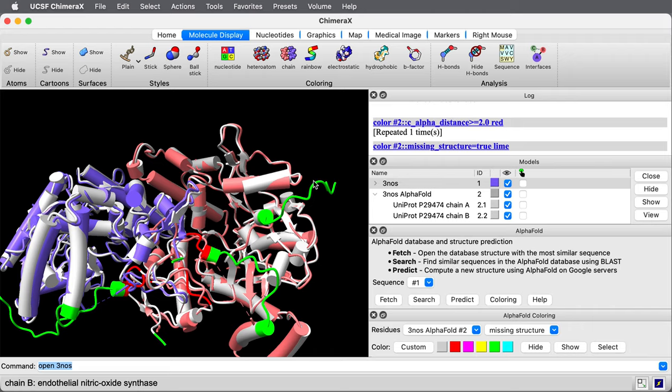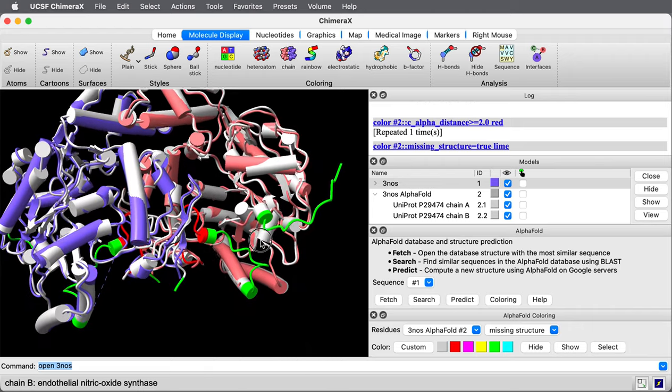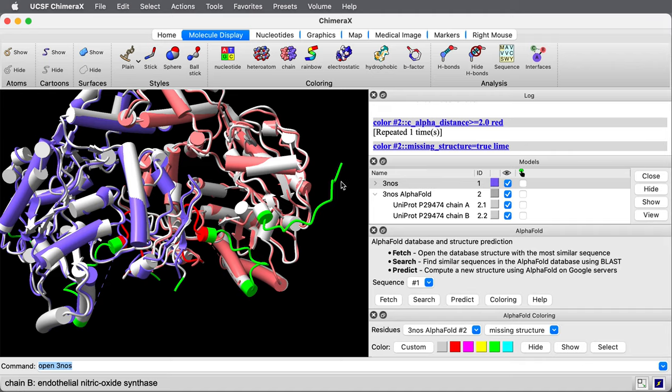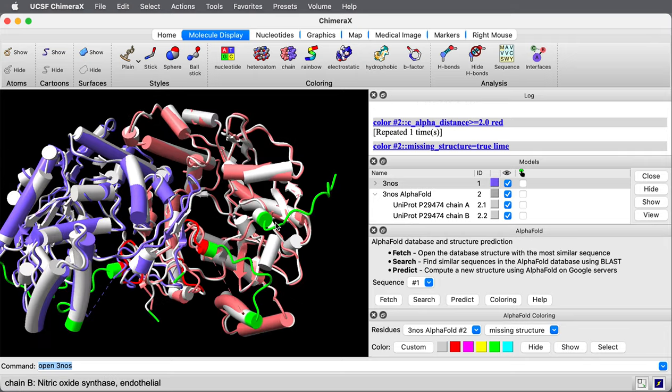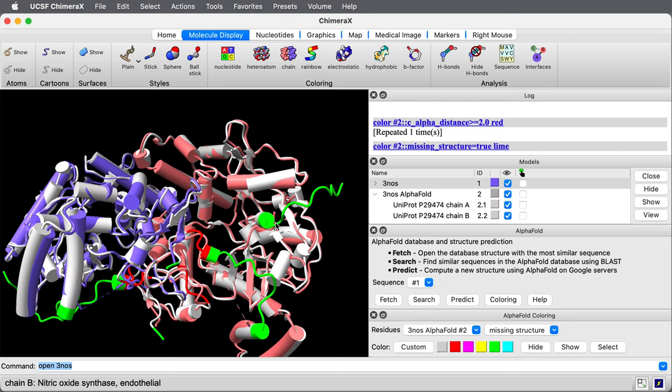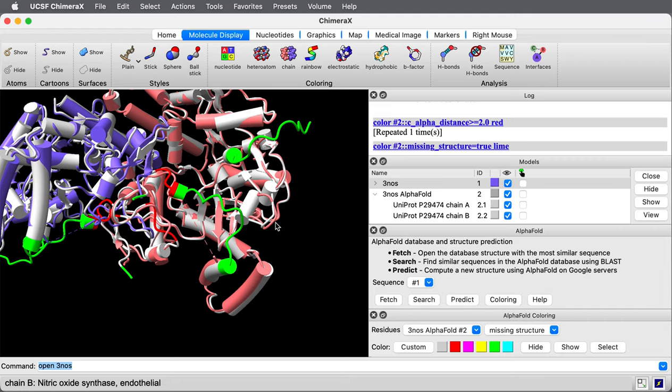The experimental sample had these residues, but they just weren't resolved. We see the tail of the structure is all in green. That's the alpha fold prediction. It's not surprising that perhaps disordered and not resolved in the experimental structure.